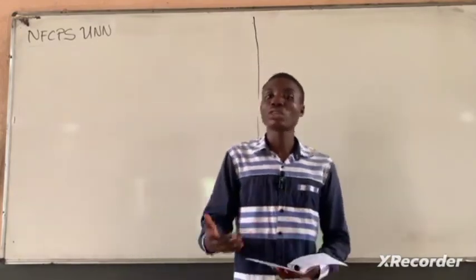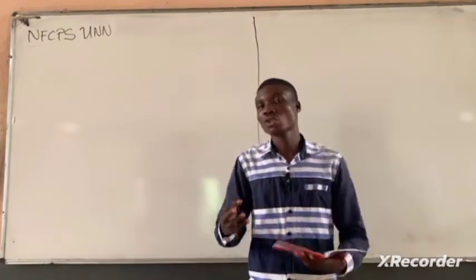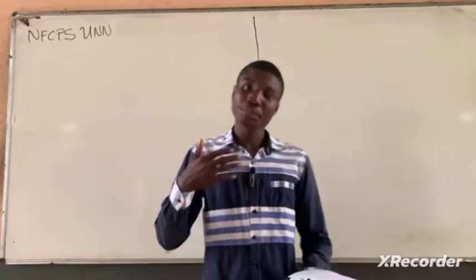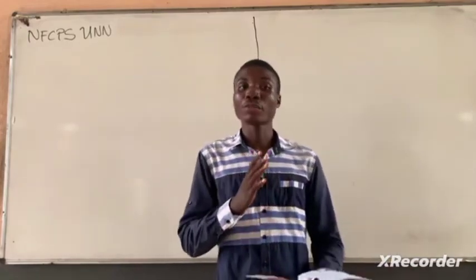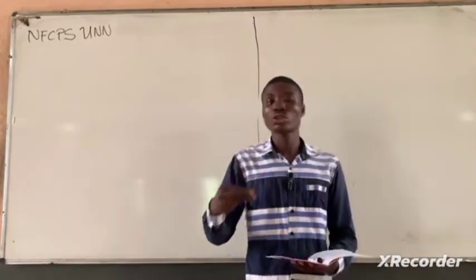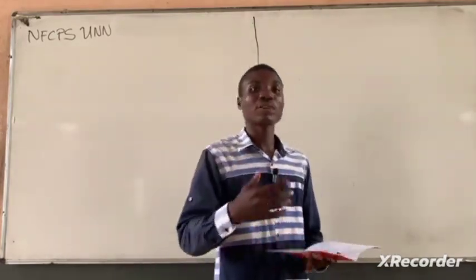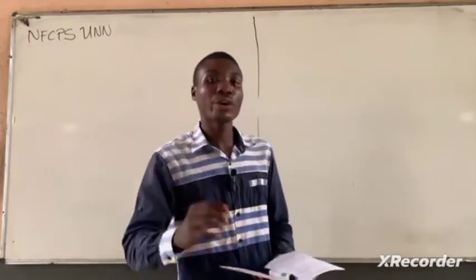For example, the conditions that affect the kind of result you get in your experiment must be studied. You must also study the different kinds of solutions that are used for different isolated tissues, because basically the experiment you're going to be conducting in this particular course involves isolated tissues. So you need to know the kind of solutions you must use for the isolated tissues. Now, usually what we use here is isolated intestinal tissue. That's the guinea pig ileum. So the implication is that the solution we use is the Tyrode's solution.